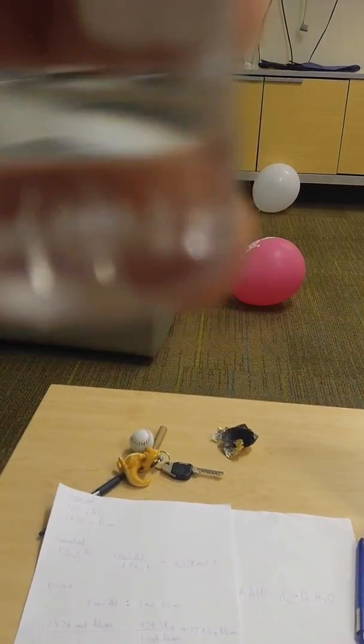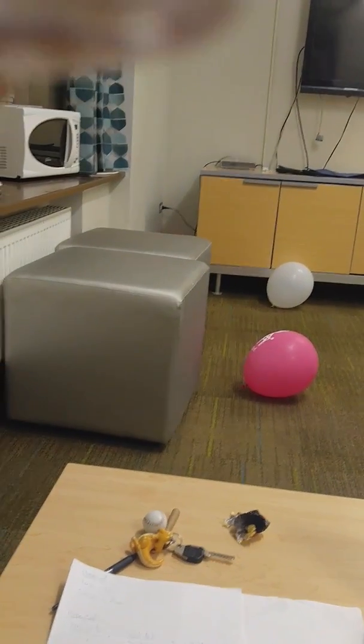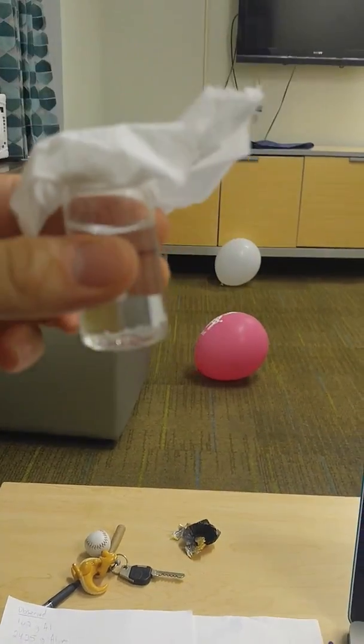Okay, so here's the progress on our alum crystals. You can't tell very much, but they're growing to be a respectable size. And what's odd is they seem to be taking a cubic shape almost. I don't know, it's very geometrically pleasing. Let's see if you could see it better. Okay, you can see them accumulating at the bottom right there.